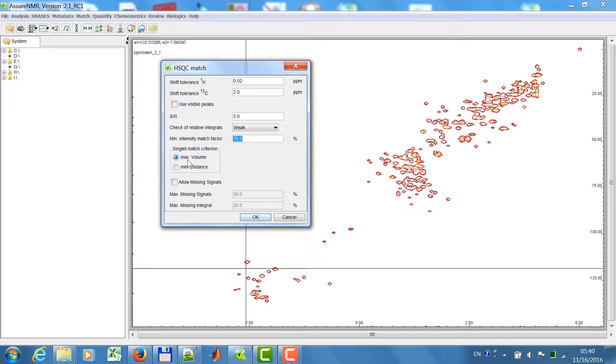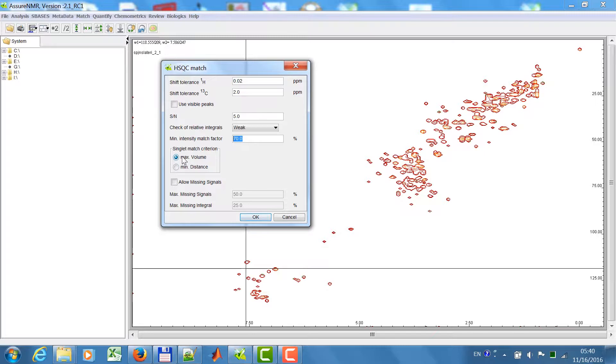Matching of singlets. There we have two options. If there is a search range and if there are several peaks, in this case I will choose the highest peak. Otherwise I can choose the next peak, the peak with the minimum distance. I don't allow missing singlets in this case.